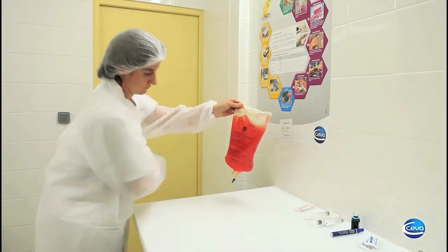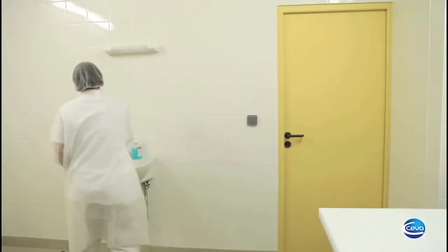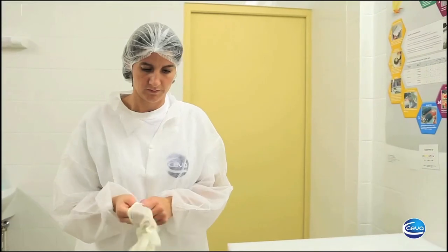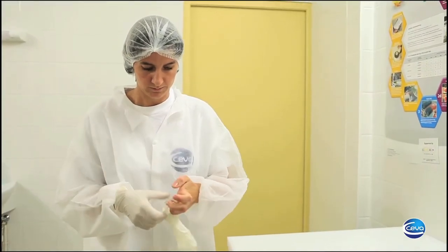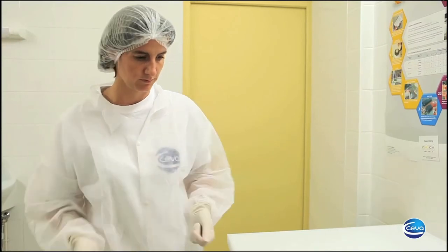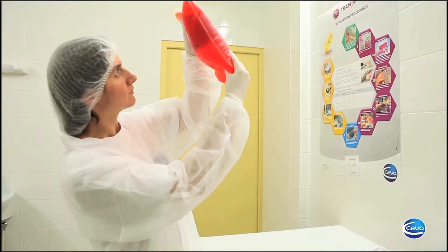Carefully remove the diluents bag from its plastic cover and place it on the edge of the table. As we are now starting to handle sterile material, it is time to wear some sterile gloves. We now want to check the quality of the diluent. Hold it against the light. It should be clear and translucent. Also check the expiry date. Discard cloudy diluents.